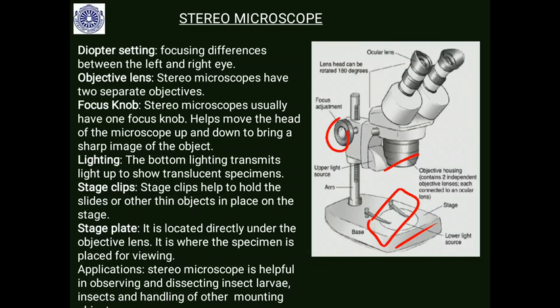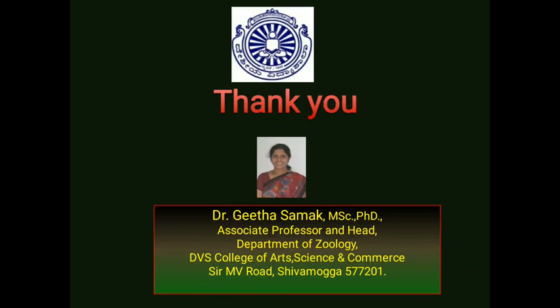So likewise, for something small, dissecting out cockroach salivary glands and all this, this stereozoom is very useful. So this is about microscopy.